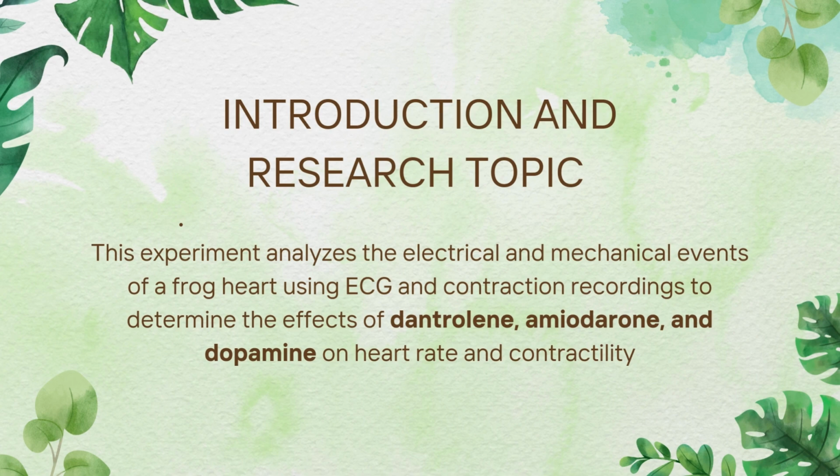Introduction and research topic. This experiment analyzes the electrical and mechanical events of a frog heart using ECG and contraction recordings to determine the effects of dantrolene, amiodarone, and dopamine on heart rate and contractility.